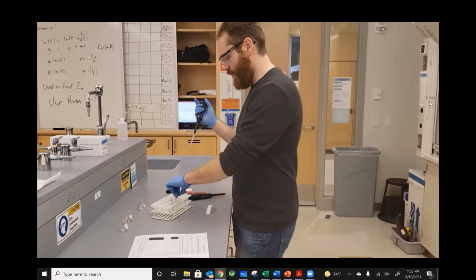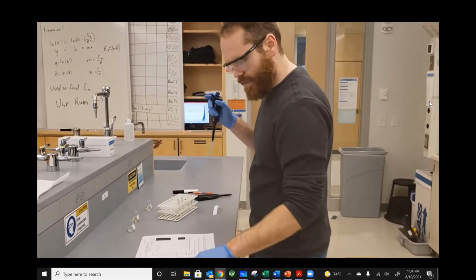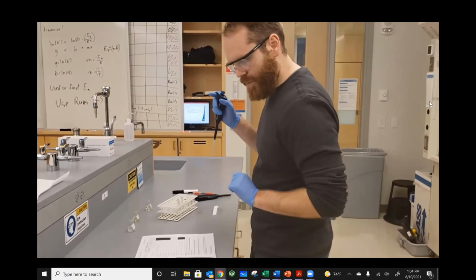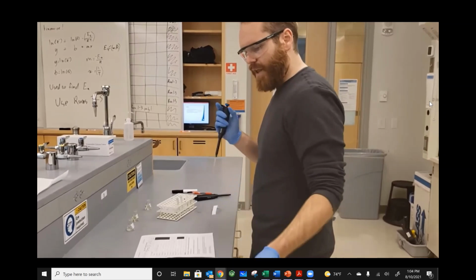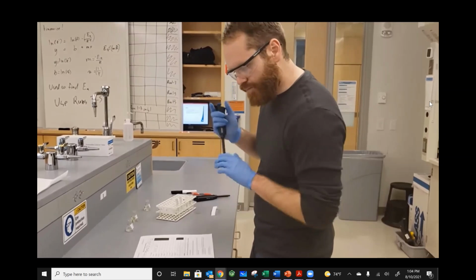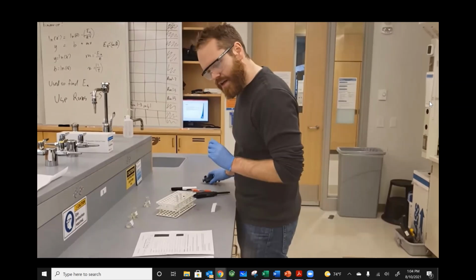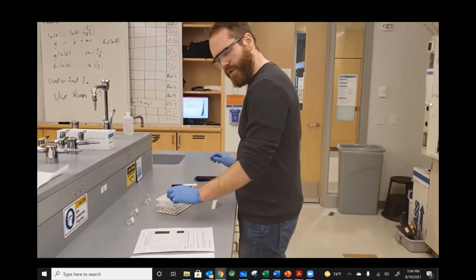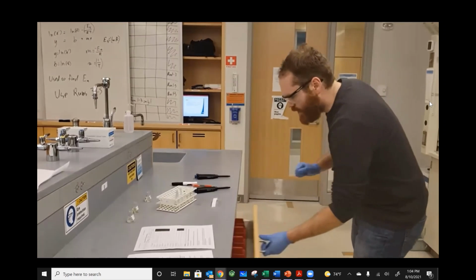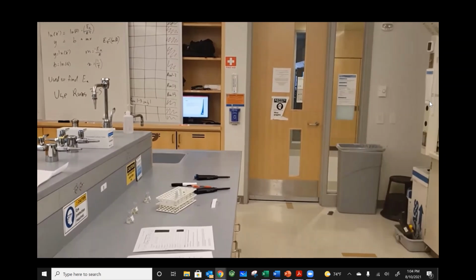The way that we start this is we have our test tube labeled 1 for run 1. We are going to dispense the correct amount for run 1 of each of these solutions here. So that is 400 microliters of hydrogen peroxide first, followed by quick introduction of both hydroiodic acid and our sulfur-containing compound. I do, however, notice that I have forgotten that in trials 1 and 2, we need to add a certain amount of water. So what I will be doing really quickly is going and obtaining some room temperature deionized water.